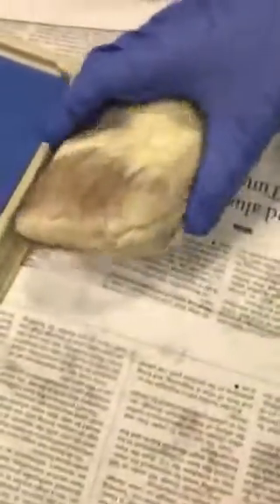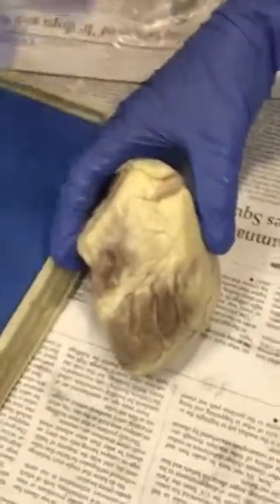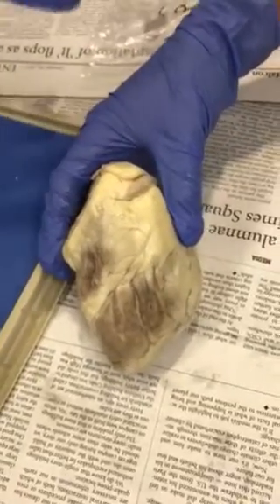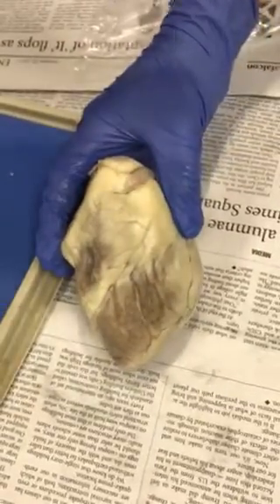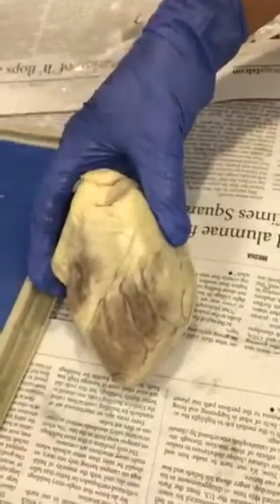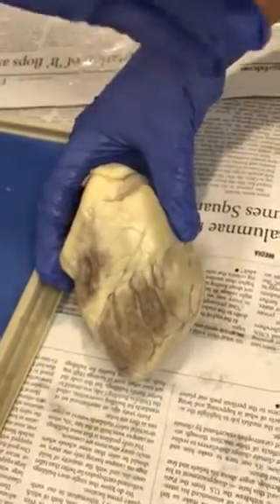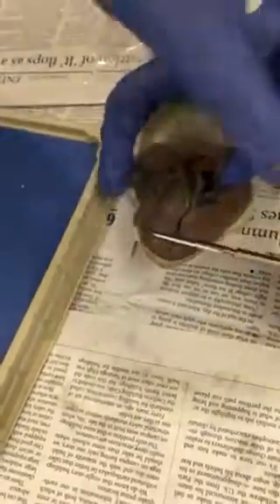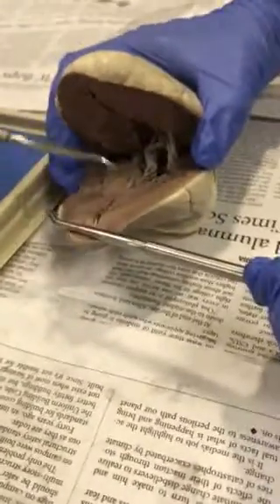Okay, so now we're going to get into the different muscular parts of the heart, both external and internal structures. Before the dissection, they removed the sac that held the heart and all of the big blood vessels. That was removed for this dissection. It's called the pericardium. And then if you open up the heart, I'm going to show you the three different muscular parts of the heart.